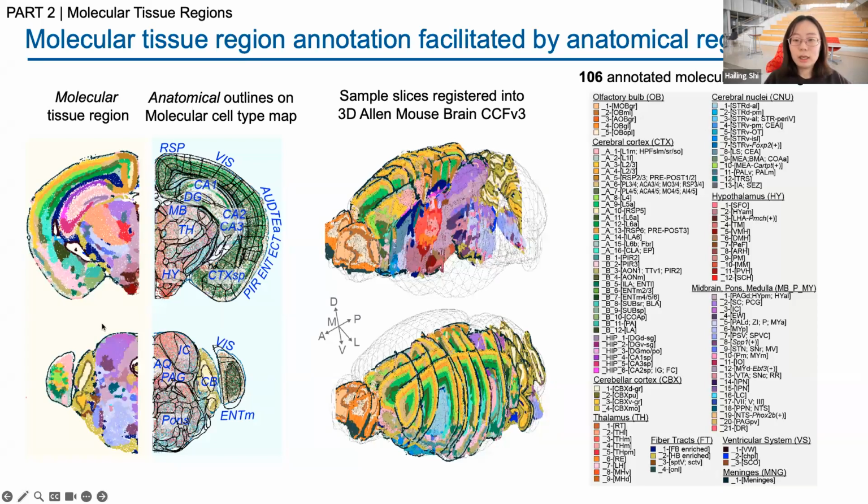So we spent a lot of effort to do this annotation of individual tissue region clusters with the symbols describing the fine anatomical definition, the preferential distribution along the body axis, or dominant gene expression markers, following the anatomical nomenclature in the Allen Institute Mouse Brain Atlas. So these efforts really try to bridge the molecular expression space with the anatomical space to make those clusters more interpretable for neuroscientists and biologists.